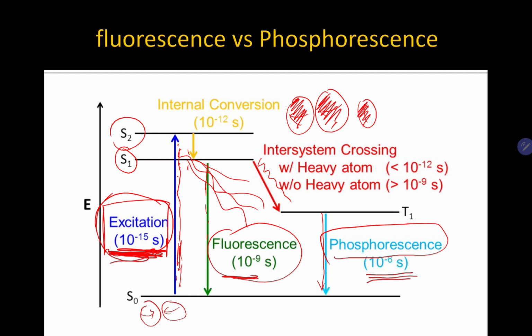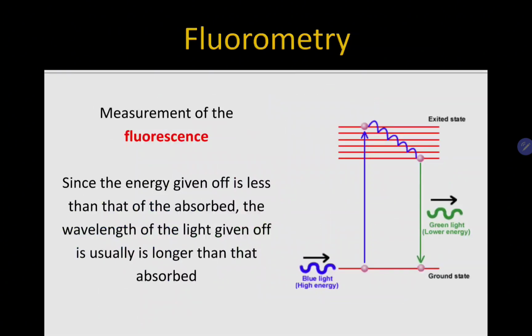Okay, so bakit man, sir? Because makita nyo naman, guys, depending on the excited light source na ginagamit mo and then the analyte that you want to measure, you can clearly measure kung gaano kadami yung amount ng electrons na present dyan, because hindi equal ang amount ng light na ginarelease ng fluorescence mo compared sa starting light source, 'di ba? So yun siya. So ang measurement of fluorescence is what we call fluorometry.